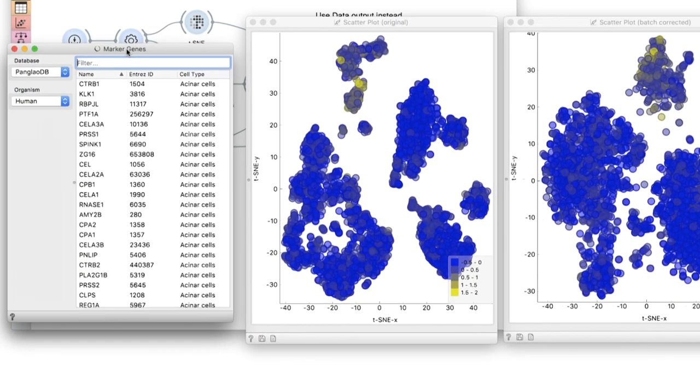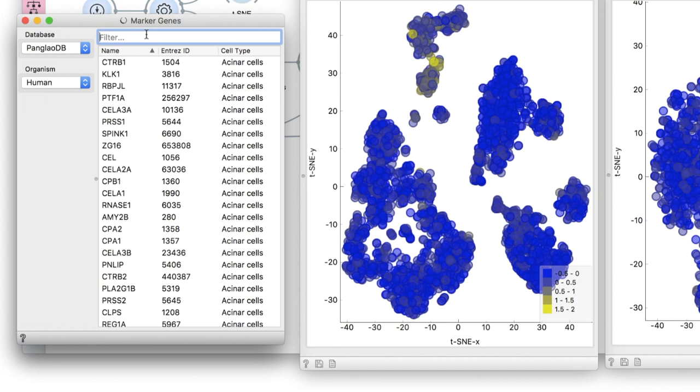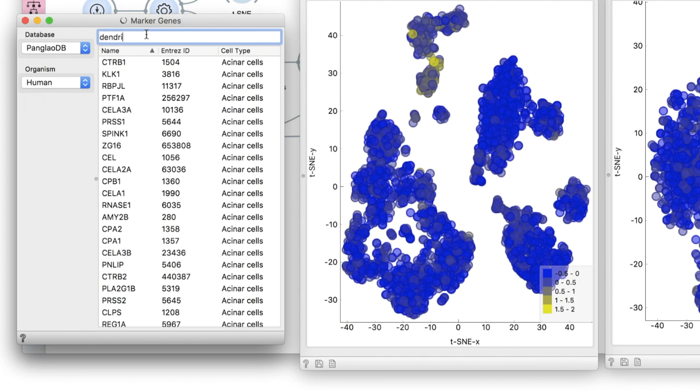Now we are able to interactively change the selection of marker genes and see the effects.